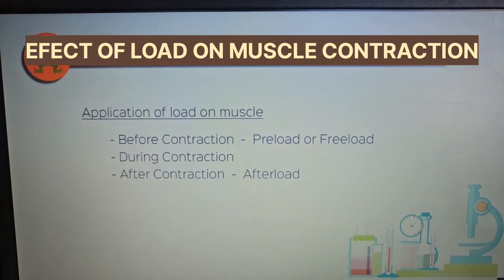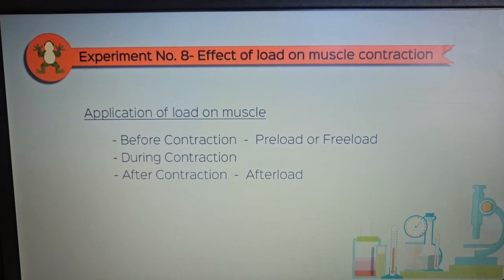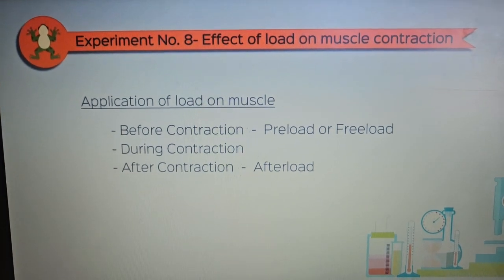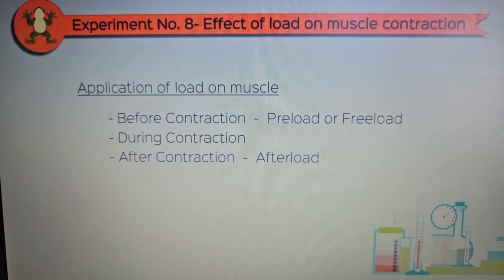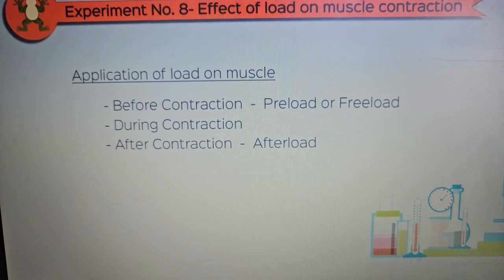We apply load to the muscle at different times in relation to muscle contraction: before contraction, preload or free load, during contraction, and after contraction, after load. We observe the effect of each application of load on muscle contraction.